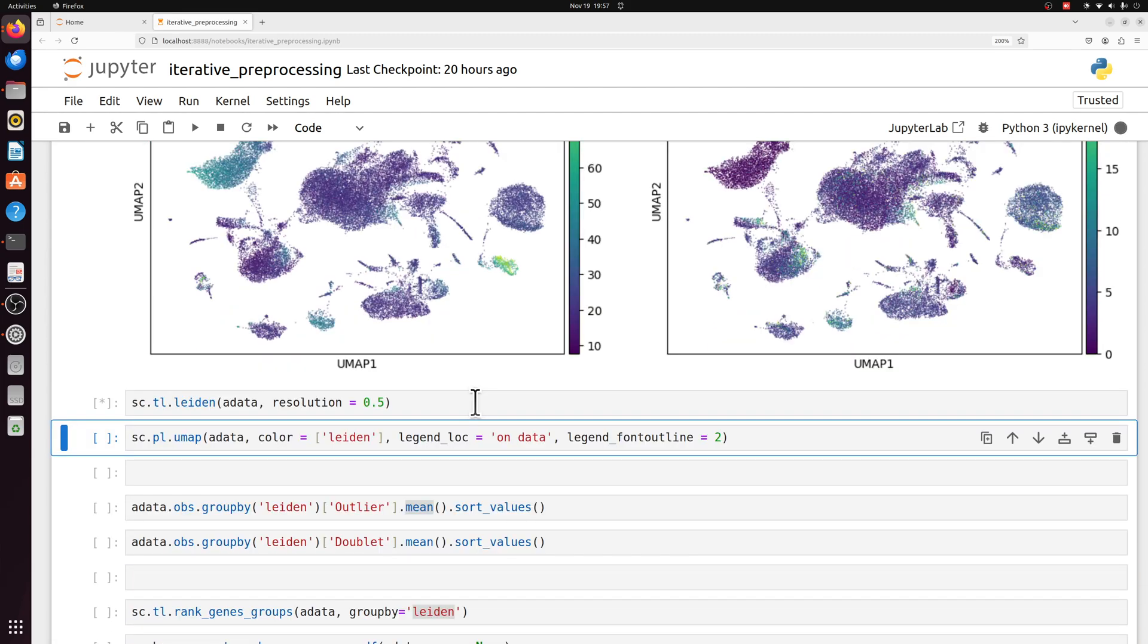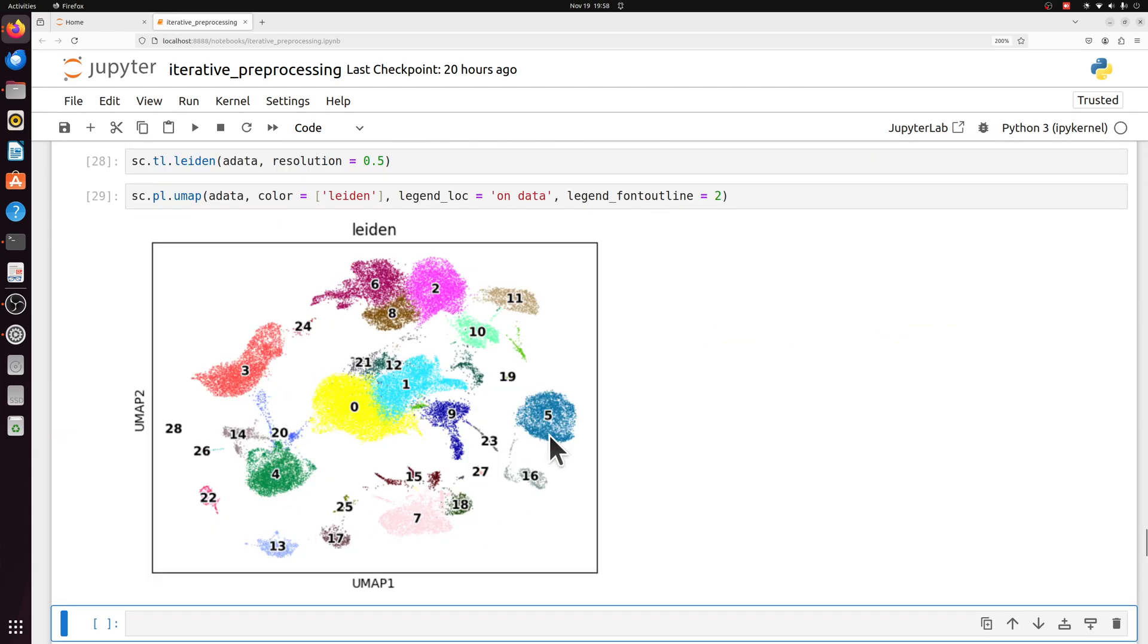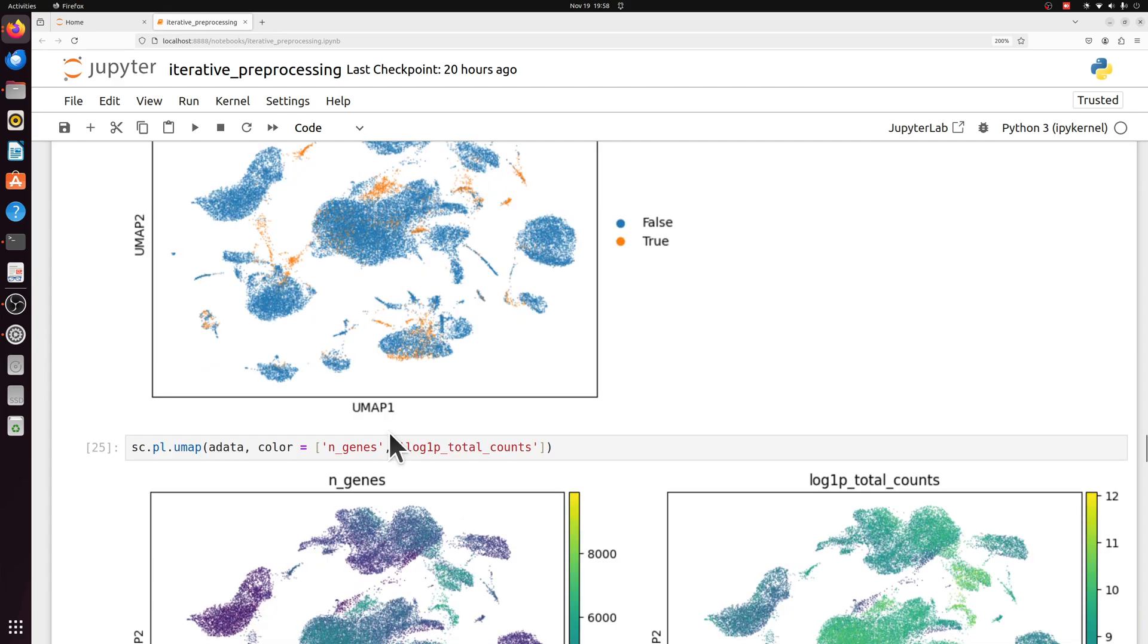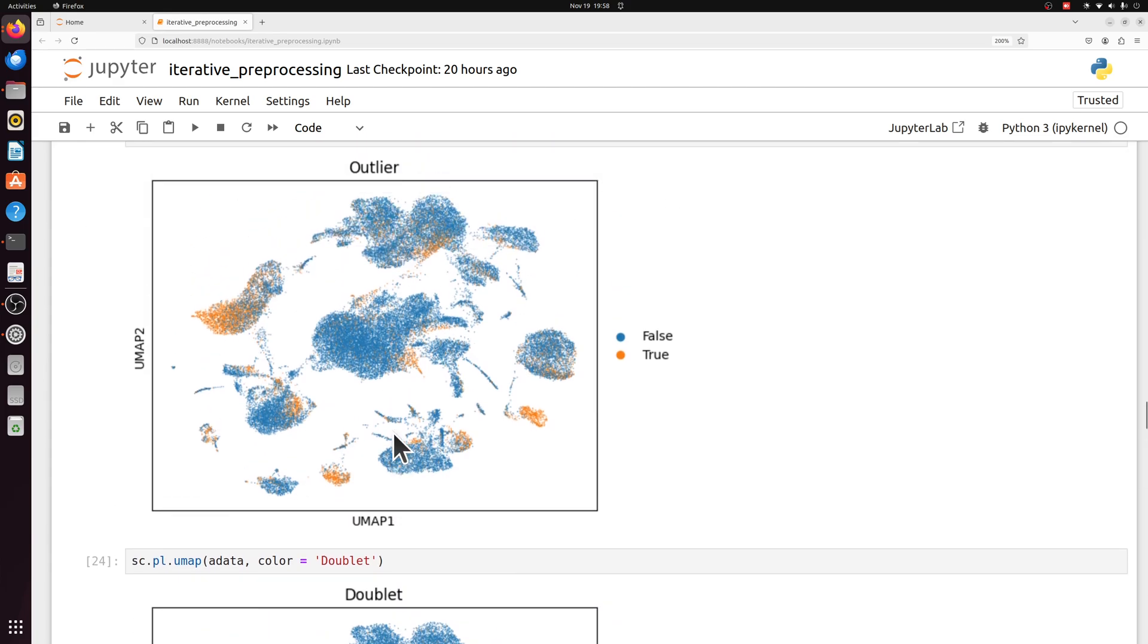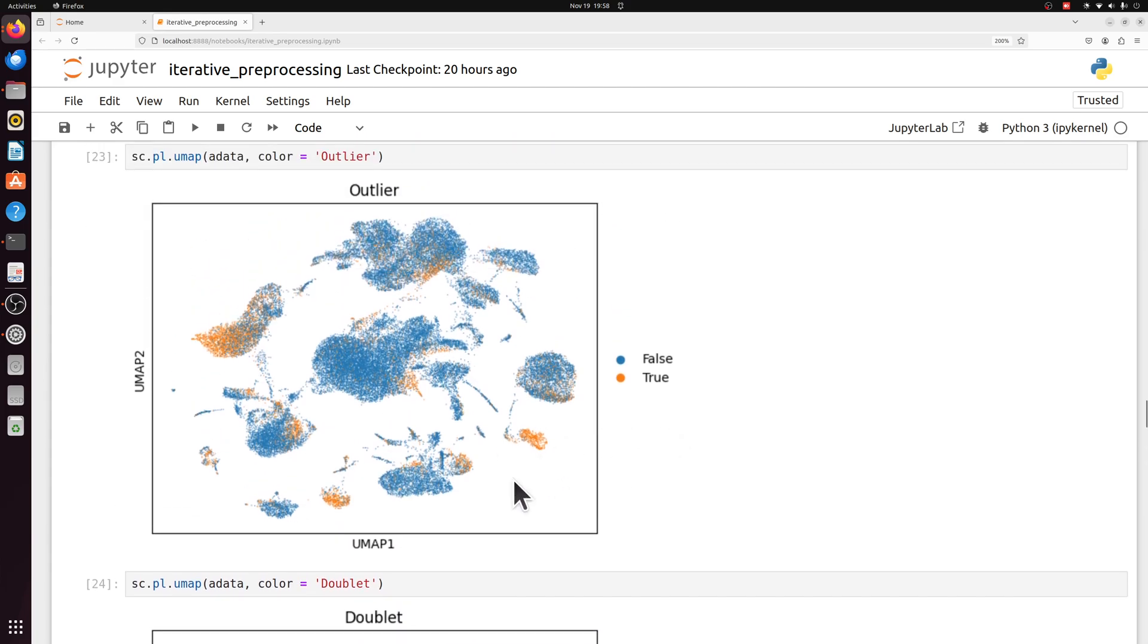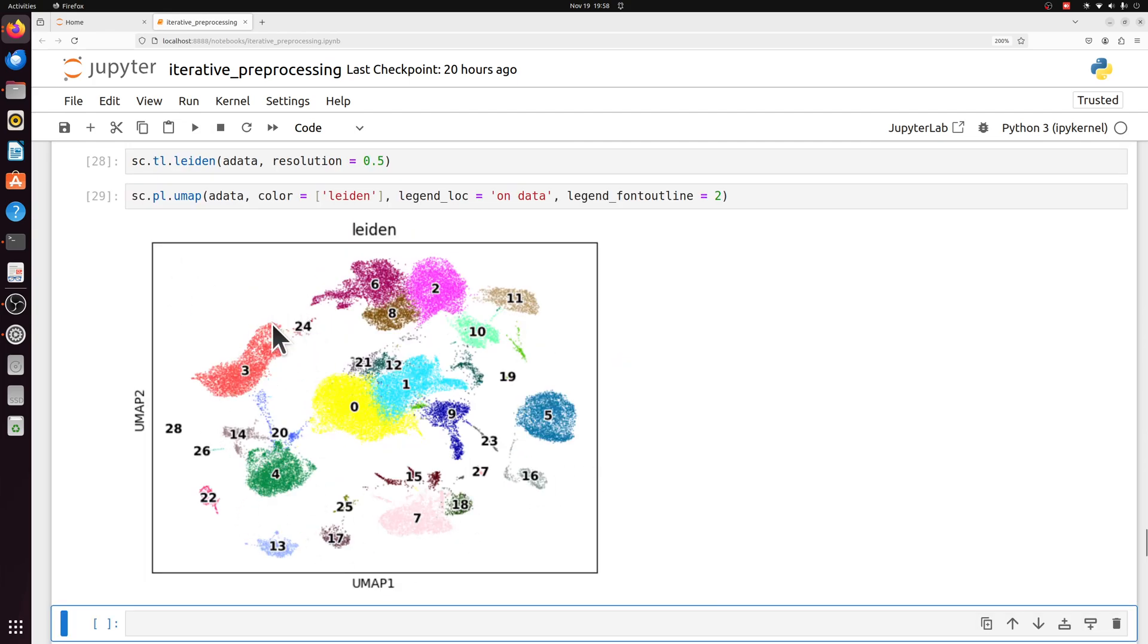So let's actually compute the Leiden clusters so we can use those. We're going to focus on these three outlier populations. I'm not going to do all of them. But theoretically, you would label all of the cells first before you determine whether any are outliers or not. So we had these three populations. We're going to focus on these three, which correspond to cluster 3, 16, and 17.